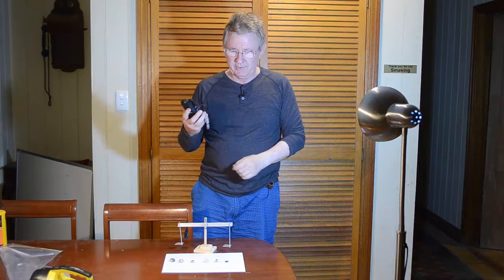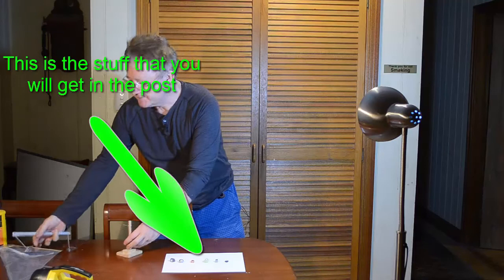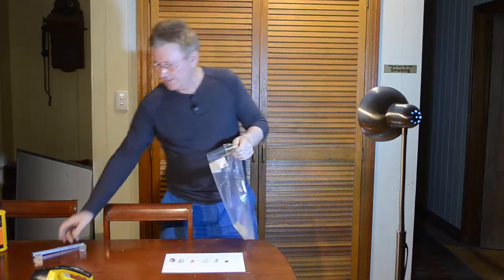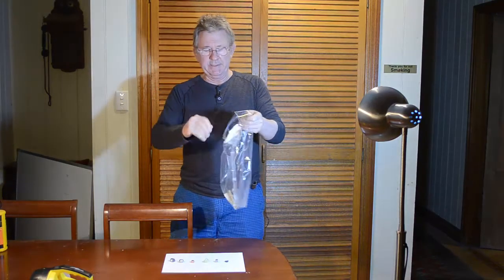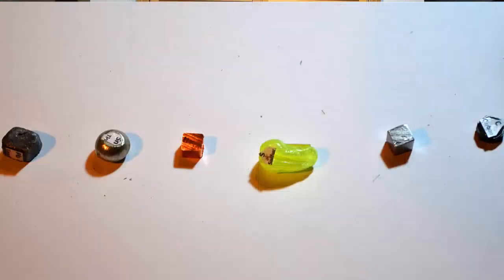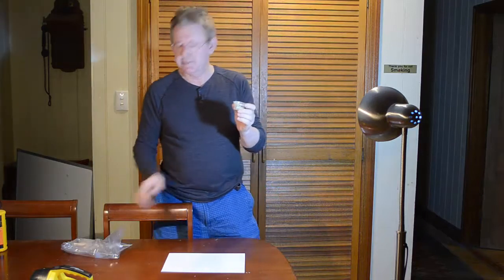This is to update you on the package that you hopefully will receive on Monday, even perhaps today, Friday. You will receive 25 sets of these things in a plastic container, 25 of those, and 25 sets of 6 little samples of elements, like so. So that comprises the class set.